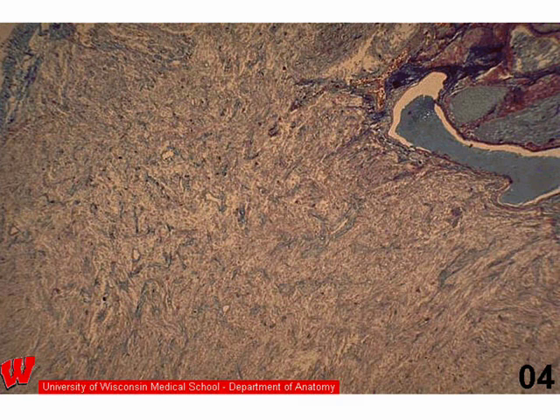The cell bodies for these axons are in the hypothalamus, and you don't see those in this preparation. You only see the axons that have descended through the infundibular stalk down into the pars nervosa. So, as you recall from the nervous system lab, the structure here is difficult to make out, basically because you have lots of cell processes and relatively few cells that are present.